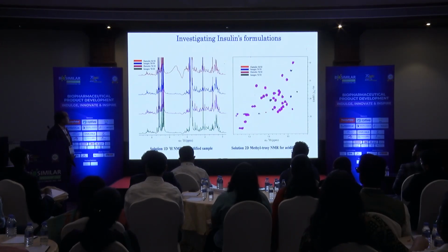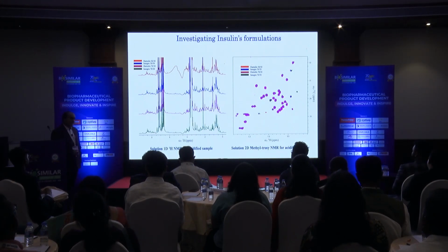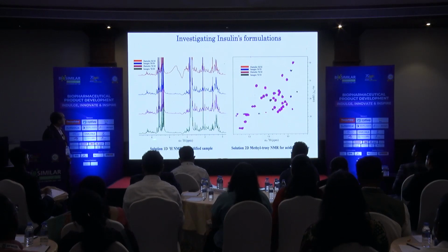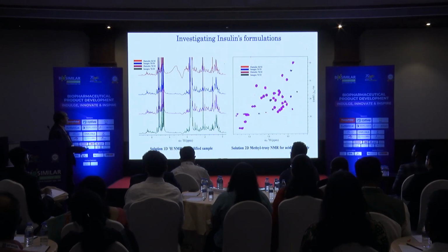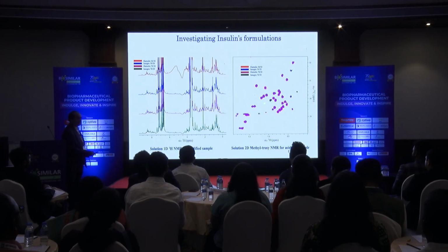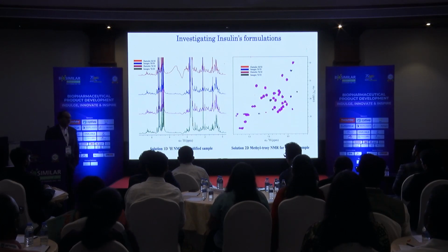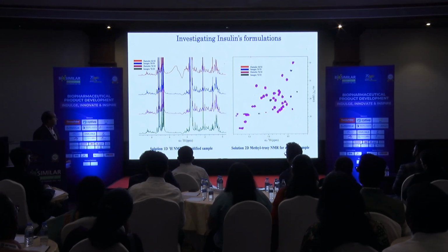Now, for showing biosimilarity, we have taken various formulations of insulin. We change them to the monomeric state, and we did the 1D NMR spectrum. You can see all those peaks. You can match them in the amide region, in the aliphatic region, and everywhere. Here, using that methyl experiment, you can see that all the peaks are matching very well. There is one peak here that is different, and that is coming from the formulation. Even that one peak which is different is because of one component that is different in the formulation. That's what shows the differences.